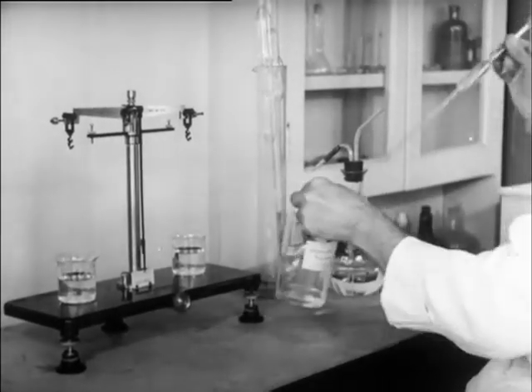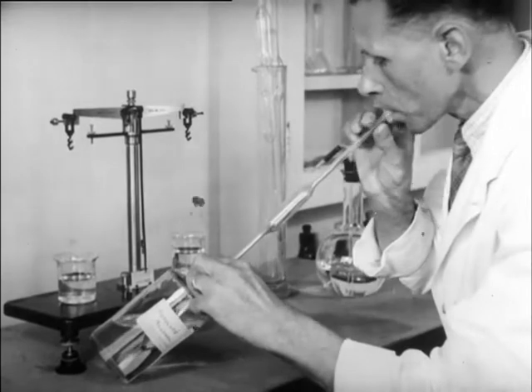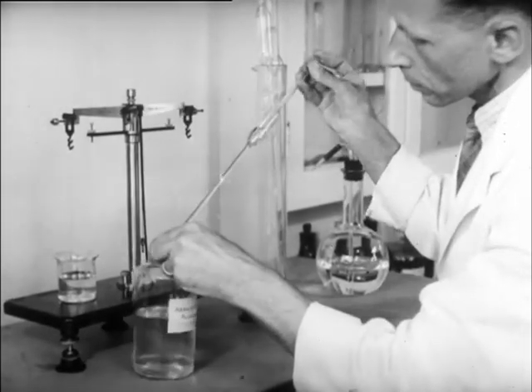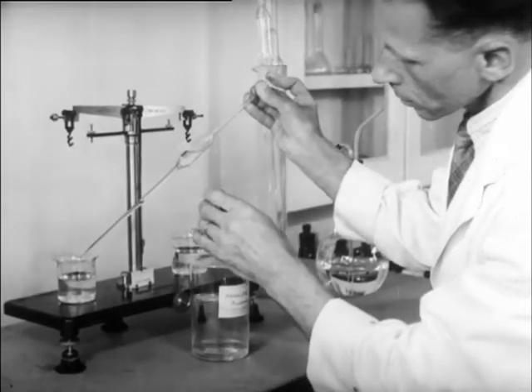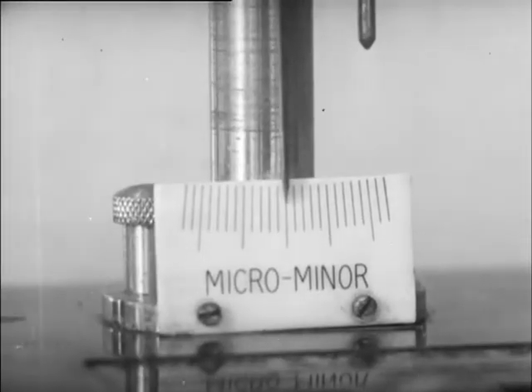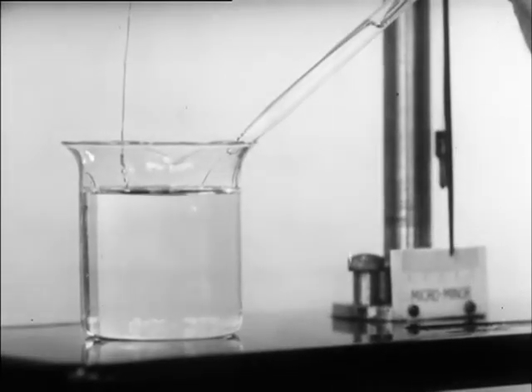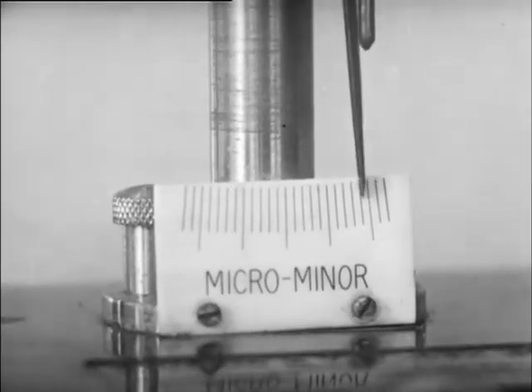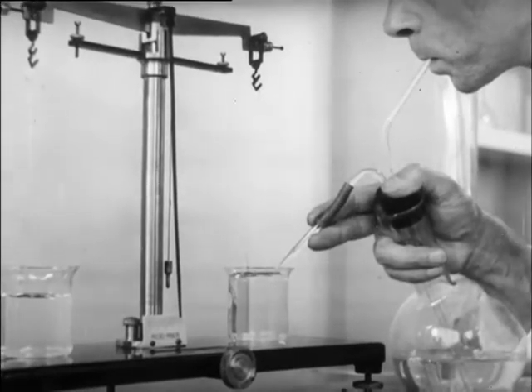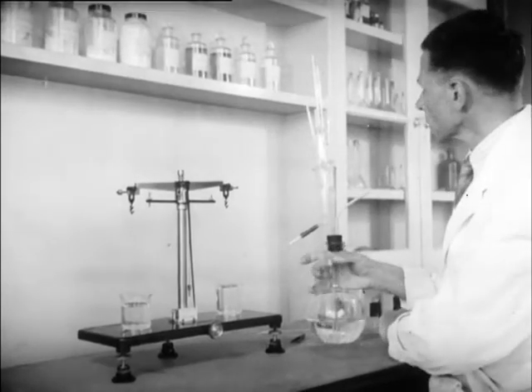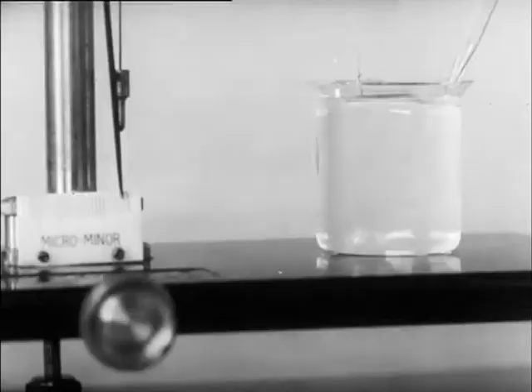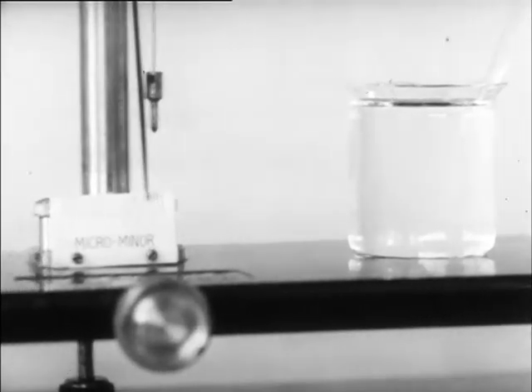The effect and variation of surface tension may be shown by causing a surface of alcohol to make contact with a balanced platinum wire loop. The surface exerts a positive pull on the wire causing the balance to deflect. If now water, whose surface tension is greater than that of alcohol, is brought into contact with a similar platinum loop on the opposite side of the balance, the needle sways back in the other direction.